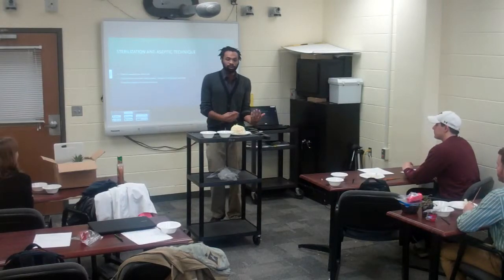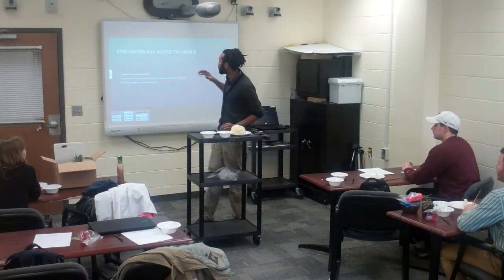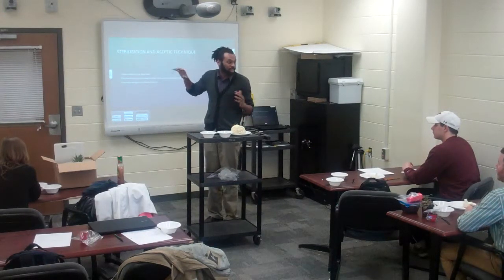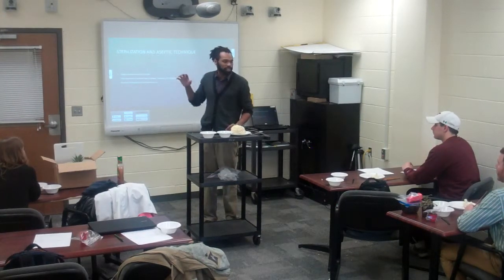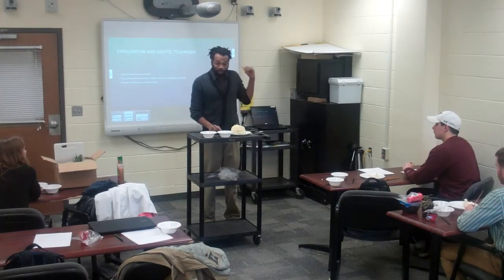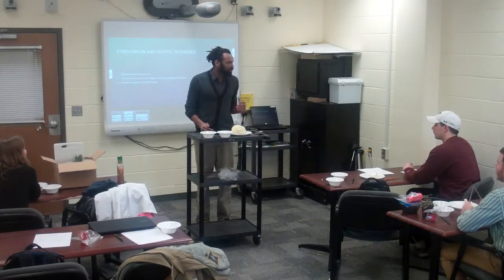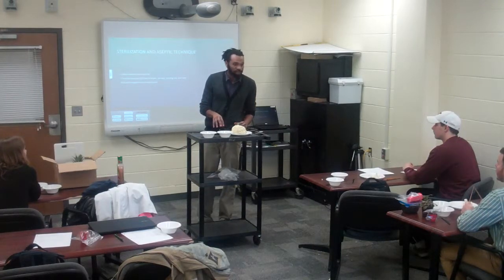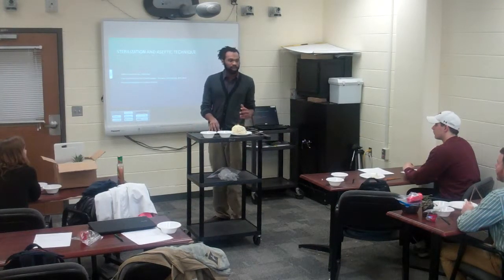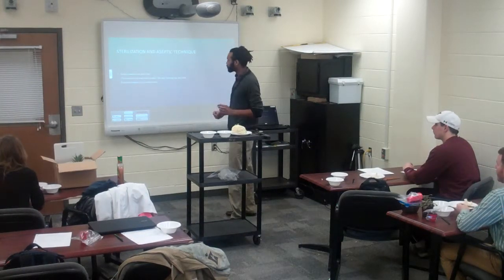All right. So the most important thing when you're doing this is the aseptic technique, because all the things there that are needed to produce any kind of mold or fungus. Any of these things will take over anything you're making if you don't keep it absolutely clean. So we're skipping over this today, not because we should, but because none of this is going to grow. We're using salad dressing, so mold isn't as big a deal, but it's the most important step when doing a micropropagation experiment, because if you don't do it properly, everything is going to be outcompeted and nothing's going to grow.